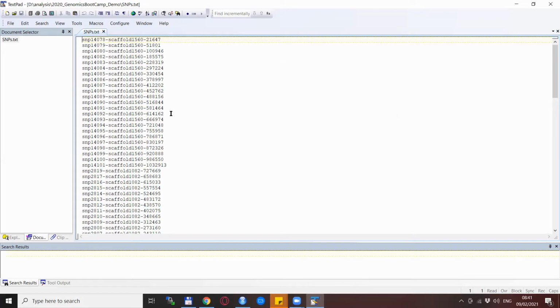You see that this is a text file with a single column where the certain SNPs are specified. They are not too many, but specifying these, you can extract them from the data file. In our case, it will be extracted from the Boer goat. Also, I would mention that snips.txt is just the name that I gave to the file, so it could be basically anything.